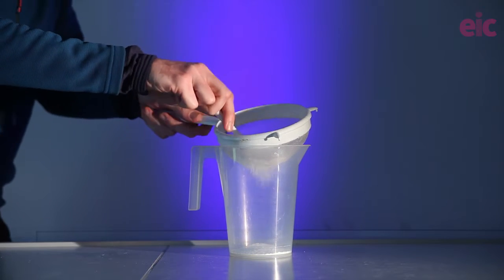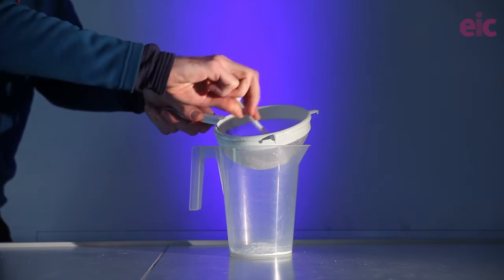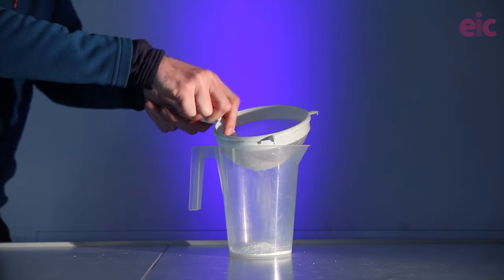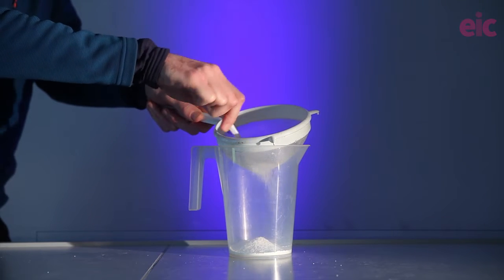Getting the powder dry and finely distributed will really help your success with this demonstration. You can leave the powder in an oven at 80°C and I always recommend sieving to break up any lumps.